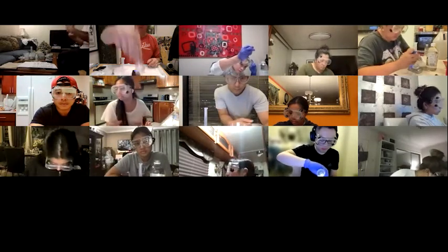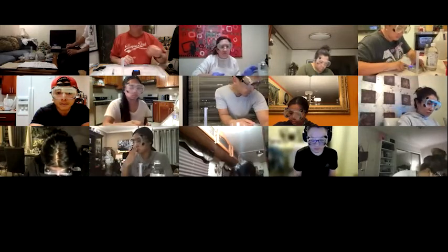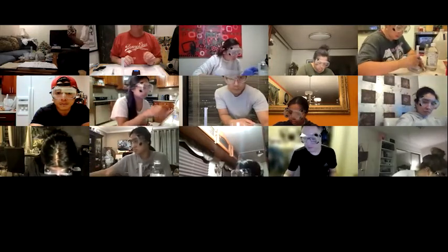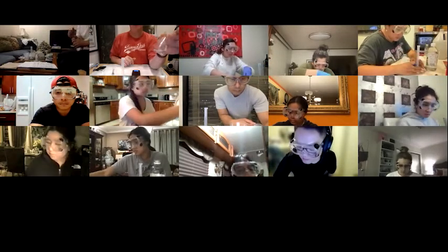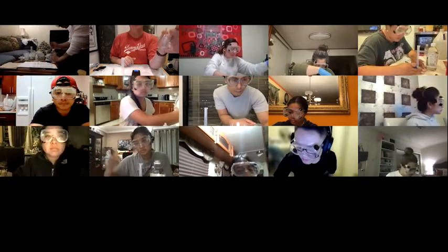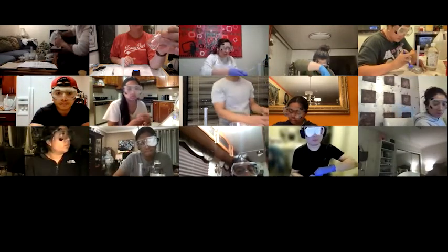Why is that? I could add another 5 mils of water to this. It would make no difference at all. How come? What are we actually titrating? Are we titrating the volume?